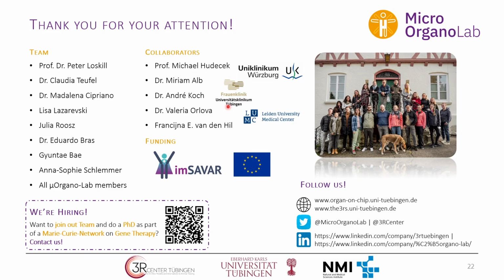My question is a technical one in regards to exclusion: which organoids do you measure your CAR T infiltration in? How did you decide which ones to include in your data analysis and which ones to exclude? Was there a standardized method that we as a community can agree upon? Yes, so for the data analysis, I'm excluding all organoids with a size below 50 microns and analyzing all of the sizes above that.